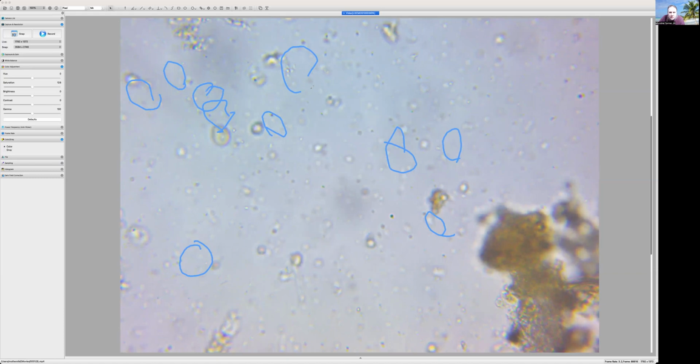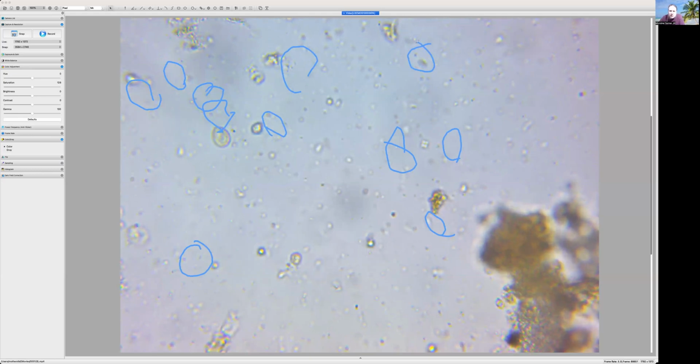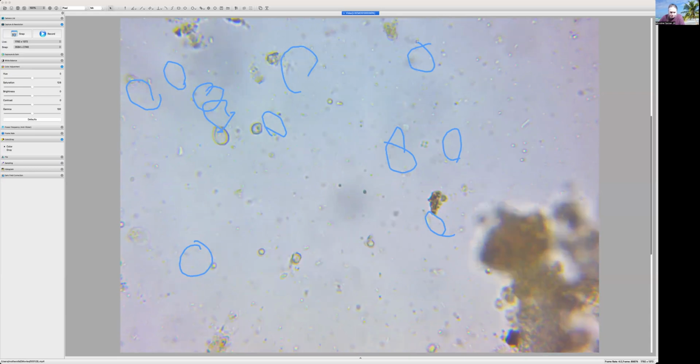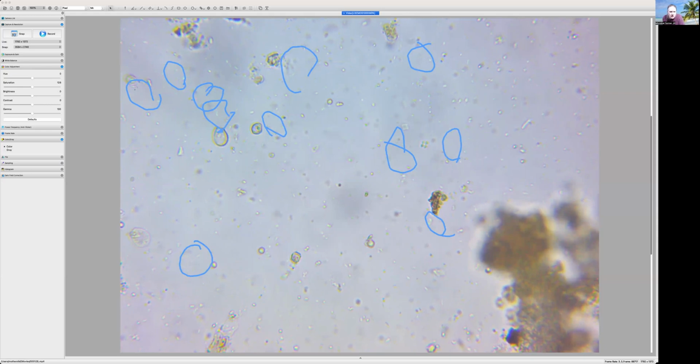What's going on up there with that spinner? Okay, this thing's spinning here. Trying to zoom in and out on him, but this is the same screen and we're just counting flagellates here. Maybe some testate amoebae, maybe. There's two. That one there I'd have to zoom in on to see what that is.